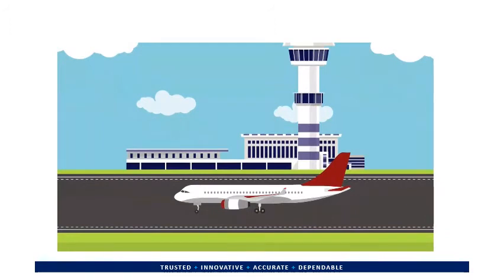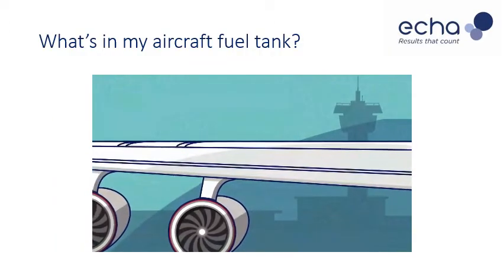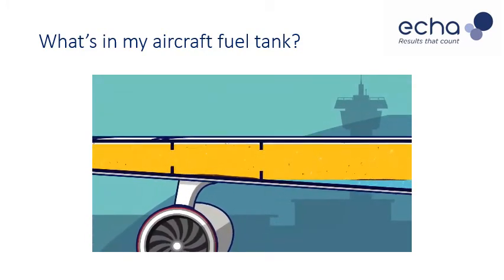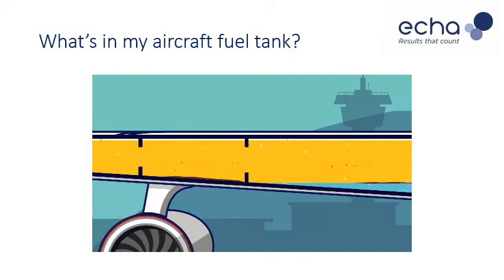This training session is based on online animation videos which are available from our website www.echamicrobiology.com. If you have water in a fuel tank, there is a risk of microbiological growth. The rate and extent of growth will depend on the amount of water present and on other factors, particularly temperature.